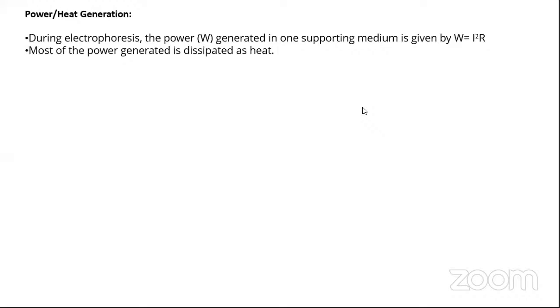Current is directly proportional to power, and power generation is directly proportional to heat generation. Heat is inversely proportional to viscosity, correct?